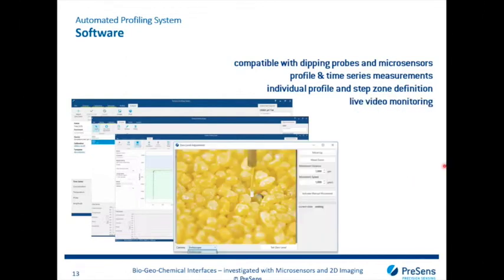And last, I would like to show the live video monitoring function of these microsensor measurements. And those of you that have worked with microsensors will know that it's sometimes really hard to know where exactly in your sample you are measuring. This is why we included this live video function. You can use either an endoscope or a small USB microscope. With an endoscope, you can even go inside the water and then monitor your sensor tip in very high resolution. It saves you, hopefully, the need to work with a bulky stereoscope or to have to work under a microscope.